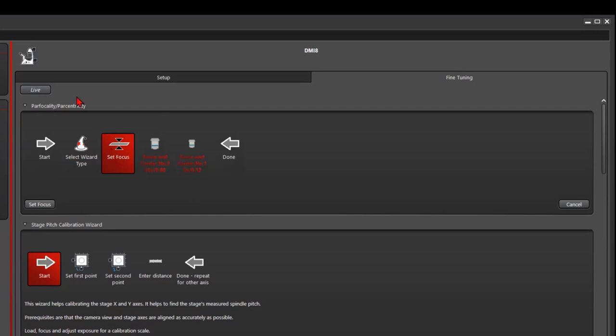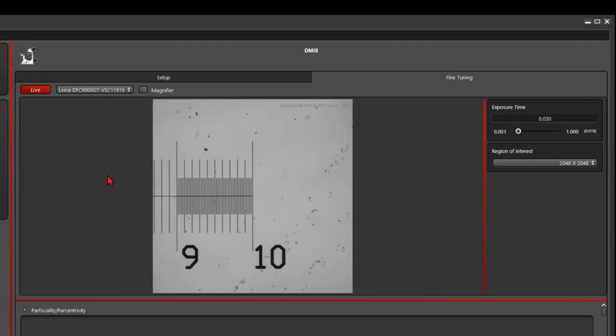So in this case, we need to run the camera in the live mode. I will run the microscope manually in bright field, turn on the shutter, get the camera image.